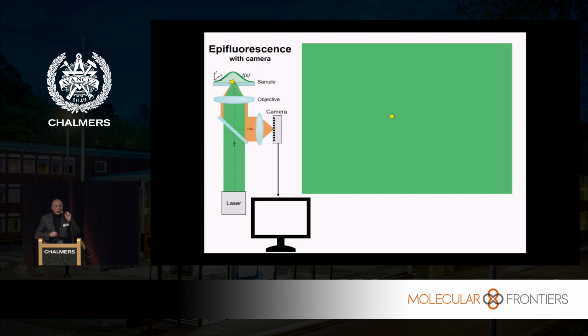Let's assume now we have turned on the molecule, and this is the molecule. Play on off, we have turned on just one molecule. Now, what people usually did, also for the PALM STORM Nobel Prize winning concept, they had a flat illumination of light in the focal plane of the microscope. You see it here. This is the objective lens, a flat illumination of light. And then this molecule produced fluorescence. It was focused on a camera. This is the camera, the pixelated detector, so to speak. And then, of course, the fluorescent light that is shown here on the monitor of the computer is diffracted because of diffraction. So here, the lens, of course, produces a diffraction blob of light here on the camera.